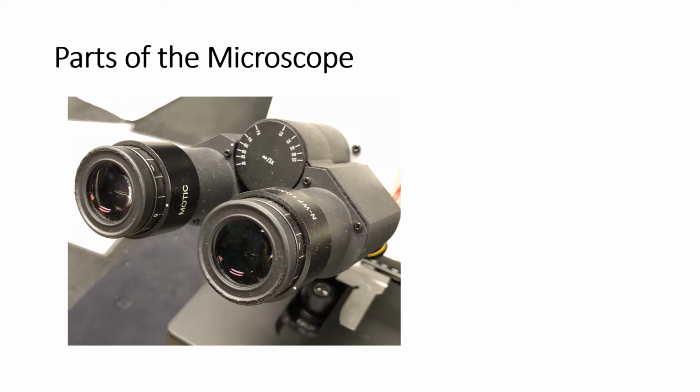I want to go through some of the parts of the microscope in a little bit more detail. The first part I want to talk about are the oculars. Remember, the oculars are close to your eye. So these are binocular microscopes, bi meaning two, because there are two ocular lenses. And these ocular lenses magnify by 10 times. And the ocular lenses, you can adjust them. They can slide around this knob, so you can increase or decrease how far apart they are from each other.